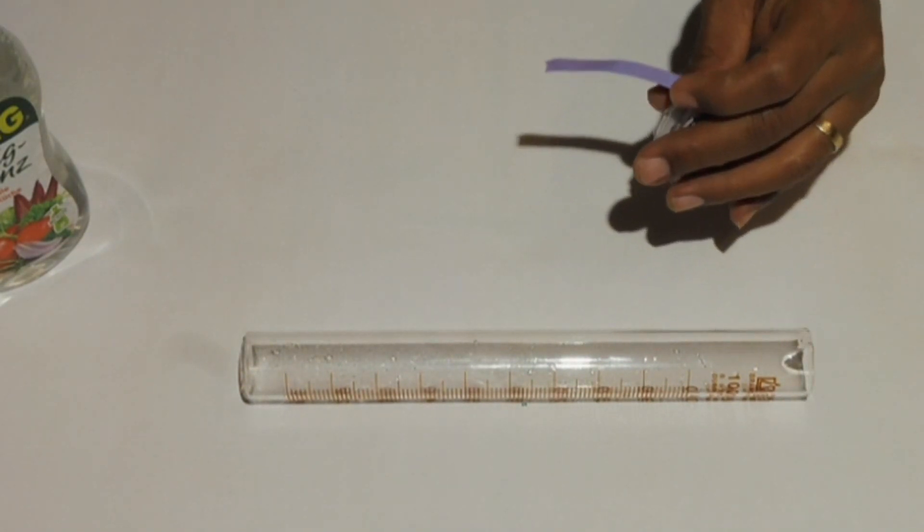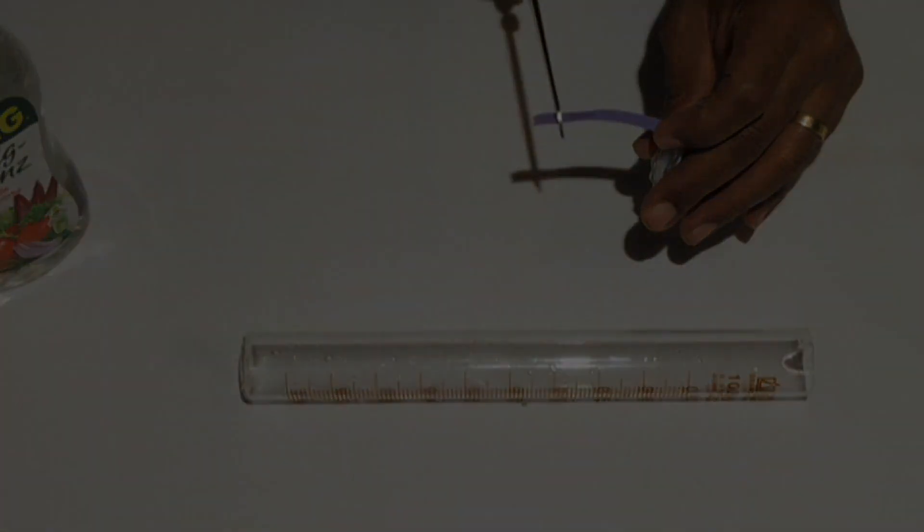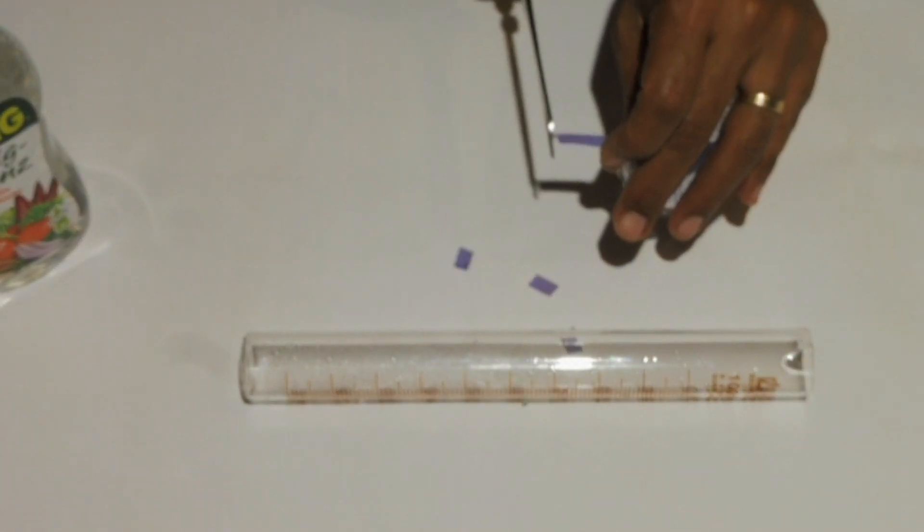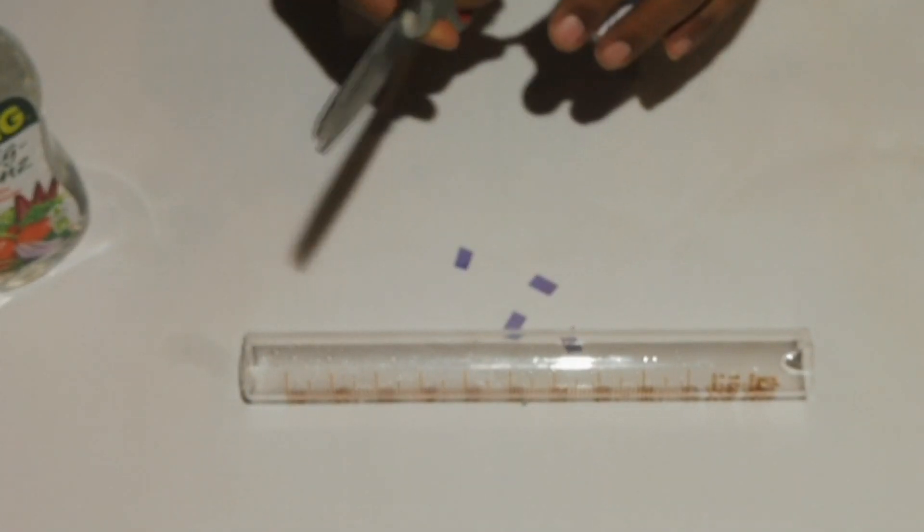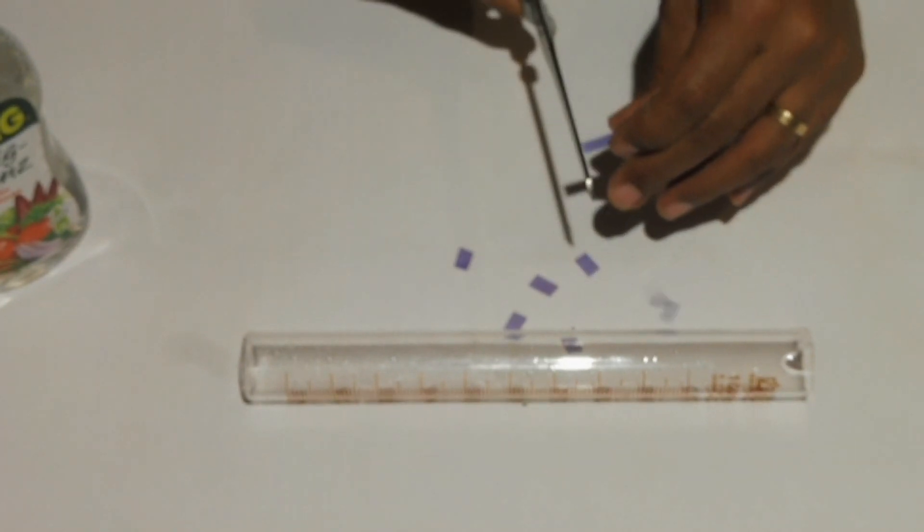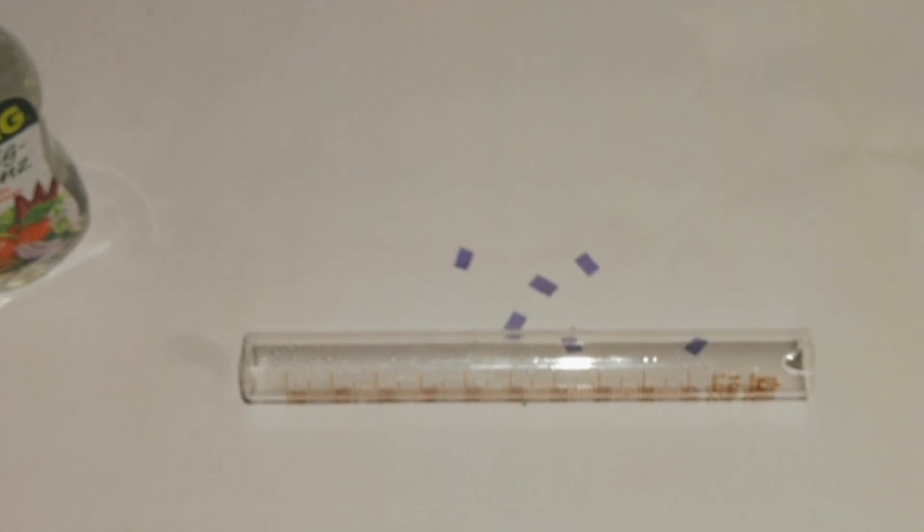We will need to cut the blue litmus paper into small pieces. We will need to know how many pieces of litmus paper can fit in the cylinder to get reasonable results. For our cylinder, six pieces fit better.